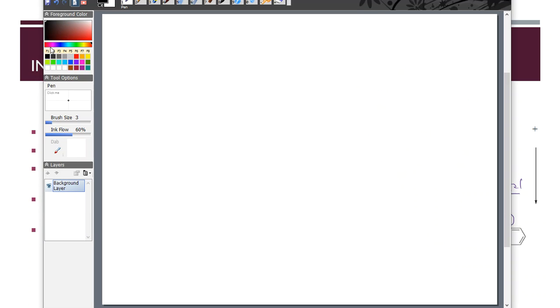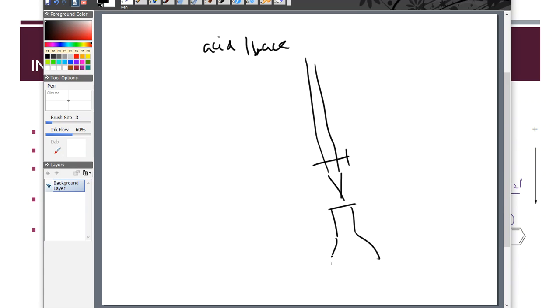The other thing I want to mention, folks, is that this is not a traditional acid-base titration that we have seen in some of our other titration lab experiments. There's nothing acid and base about any of this, which is another reason that we pull in this titration. So here is the sample, and the sample has a buffer.